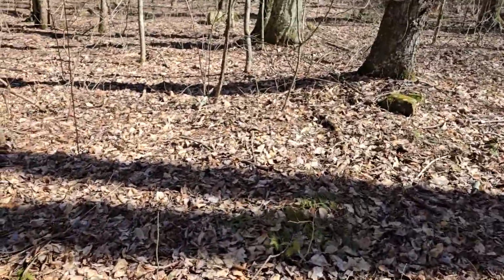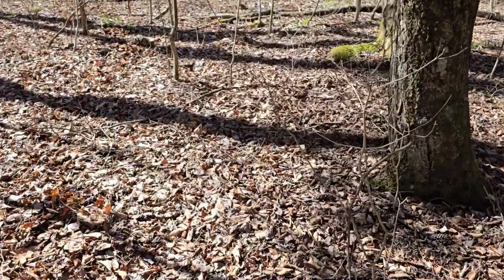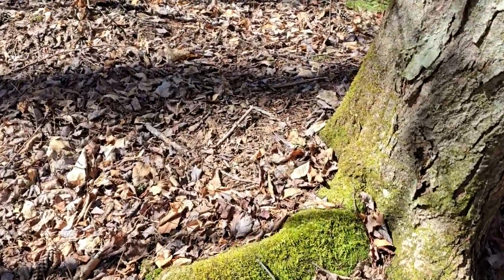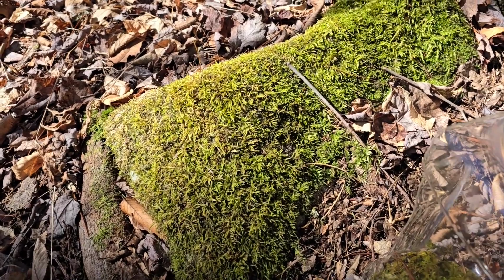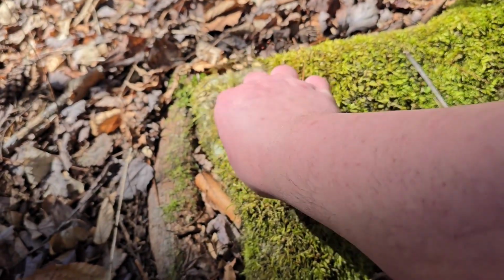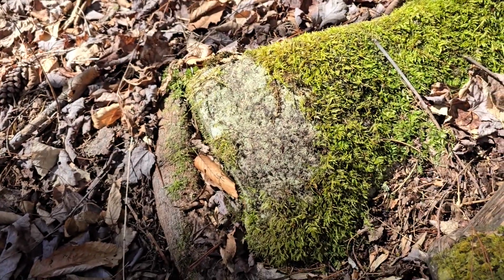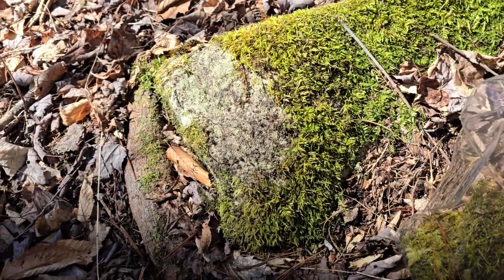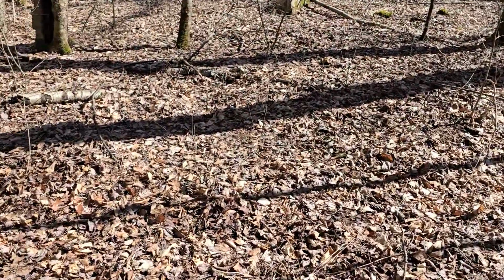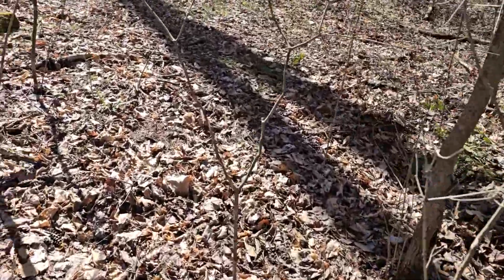I'm sure we could find some lichen or something over here. Like, there's a nice chunk of moss right here. I'm going to take some of that off of that rock. Because the moss growing on the rock would offer a slightly different microbiome than moss growing on the log. So we'll take a little bit of that as well. I'm not worried about keeping these separated because they're all going to get mixed together anyway. This video isn't about seeing what grows where and what grows on what. This is just about seeing what we can find out here. So once I get back to my shed, all these samples are just going to get mixed together anyway. So it doesn't really matter if I keep them separated or not.